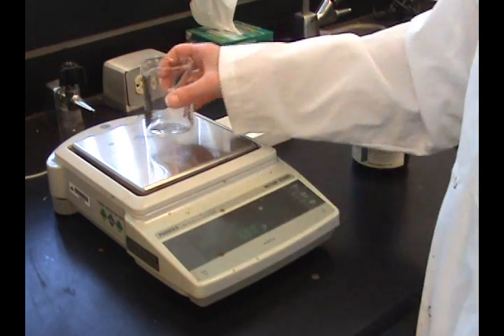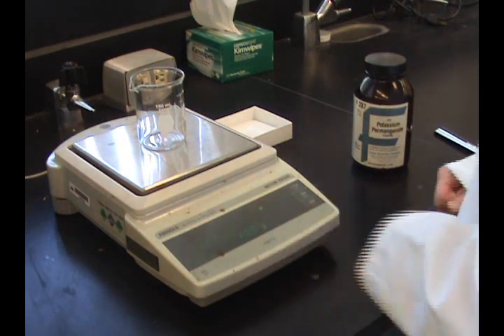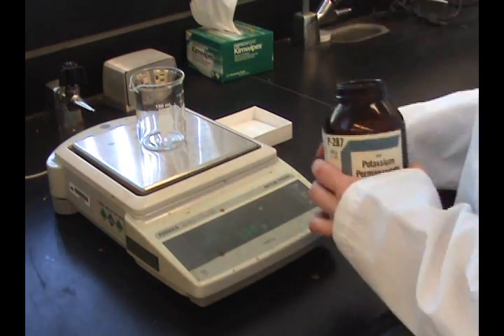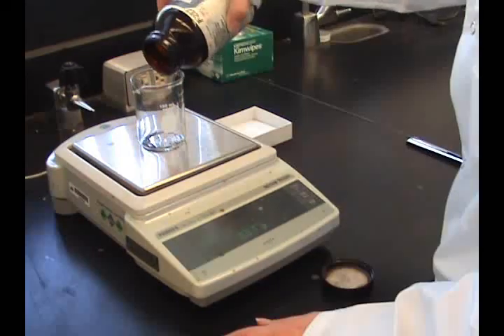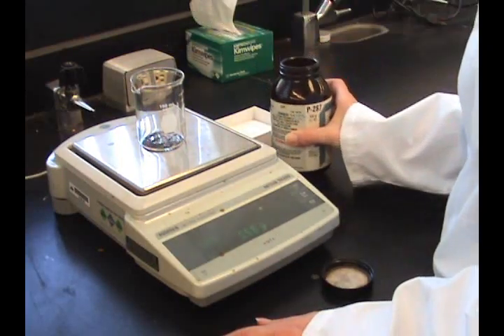Weigh the approximate mass calculated on a top loading balance. Tare a clean dry beaker and slowly roll or tap some crystals into it. To minimize waste, do not weigh excessive amounts.